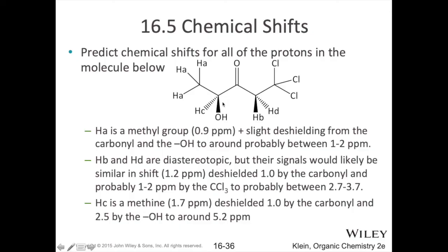So there's going to be a little bit of deshielding there. Not as much as you would expect if the alcohol group were attached directly to this carbon. But again, you probably expect it to shift somewhere a little bit further down from 0.9. Okay, so somewhere between 1 to 2.